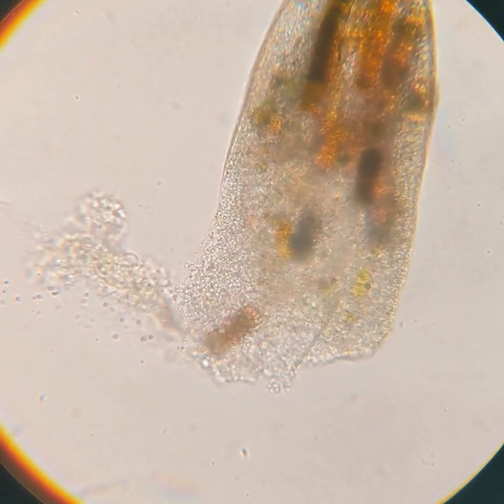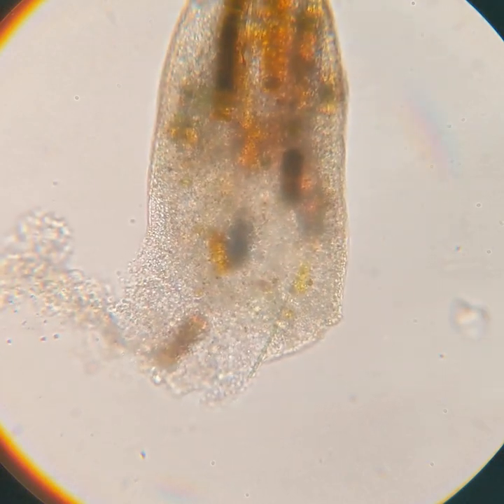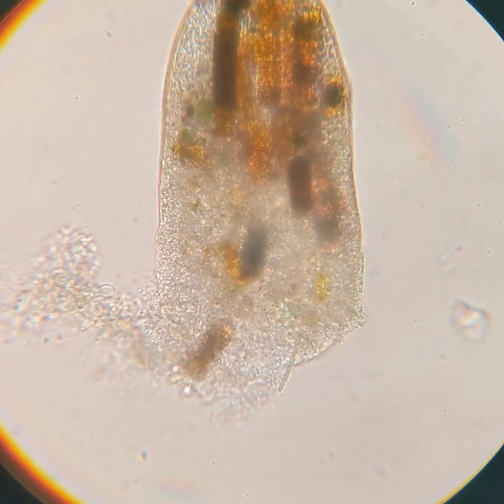Through the rest of the video, if you watch closely the cell membrane, you'll see that little by little it completely breaks down until there's pretty much nothing left holding this guy together.